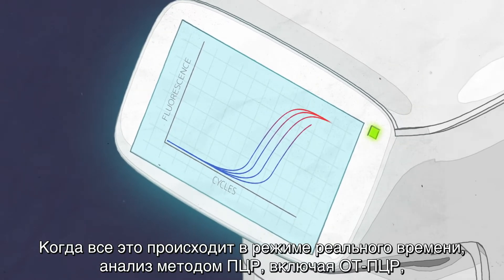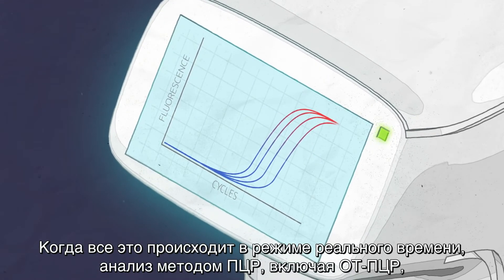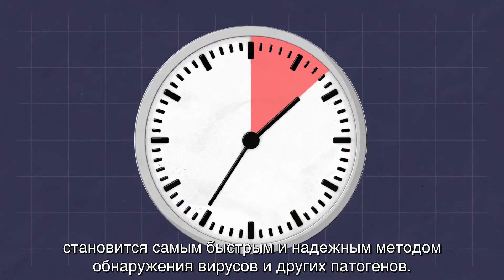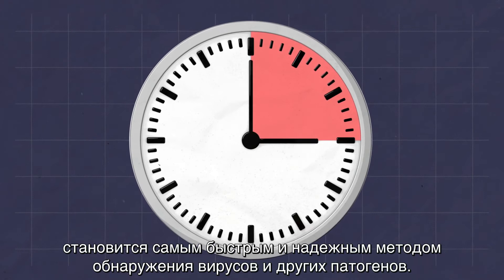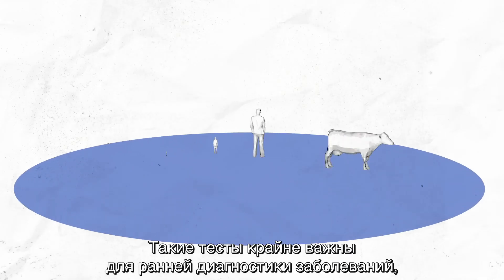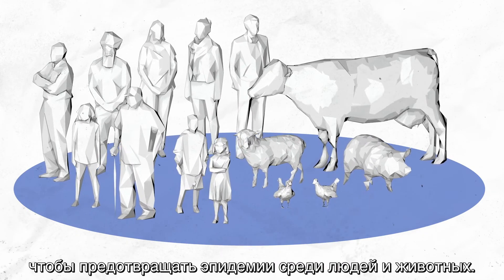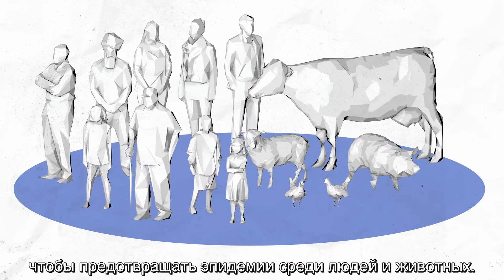When done like this in real time, PCR tests, including RT-PCR, are the fastest and most reliable methods for detecting viruses and other pathogens. Such tests are crucial in the early diagnosis of diseases to counter epidemics in humans and animals.